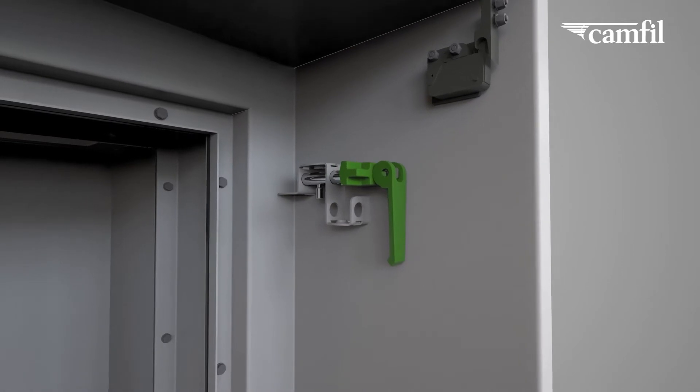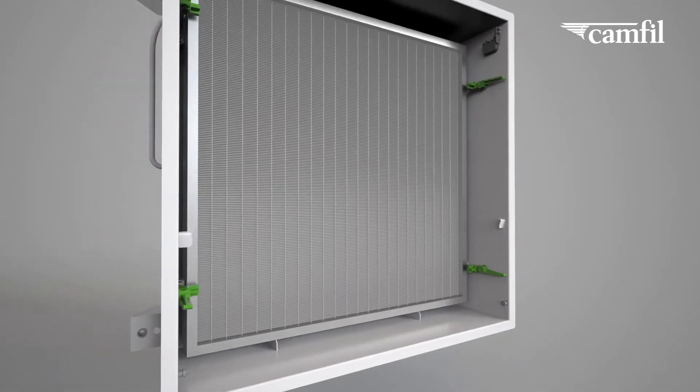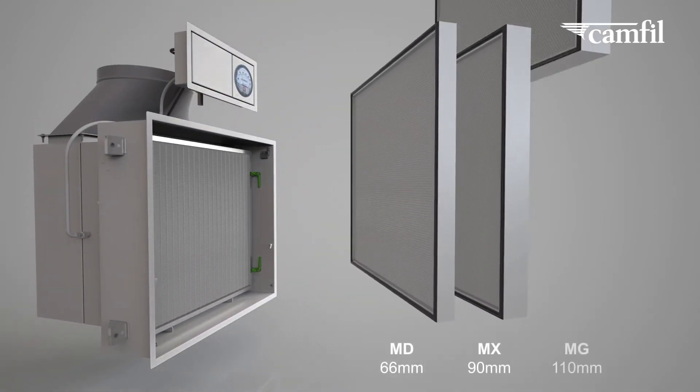Another patented CleanSeal family design feature are the adaptable, tool-free, quick filter clamps, which allow the integration of different HEPA filter depths for enhanced energy performance.